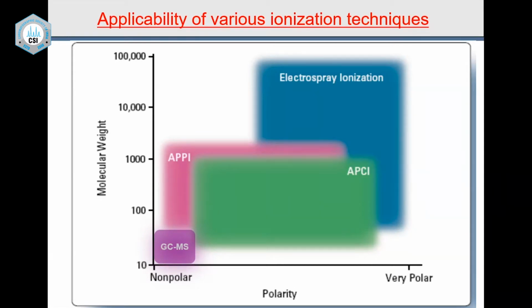At one time, we were not even thinking about doing mass spec for proteins and peptides, but today it has become very, very common to do mass spec for proteins, peptides, enzymes, etc. So it has taken a tremendous position in the analytical industry, where the majority of people are using LCMS rather than GCMS, because the applications are very wide, especially biochemists who never dreamt about a mass spectrometer before in their analysis, and now the biochemists cannot live without a mass spectrometer.